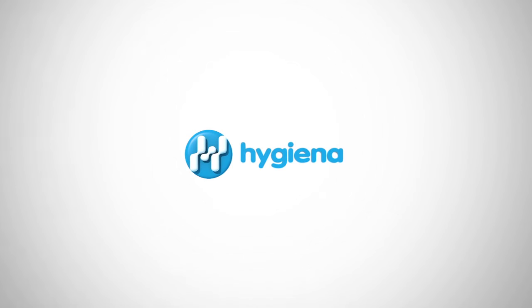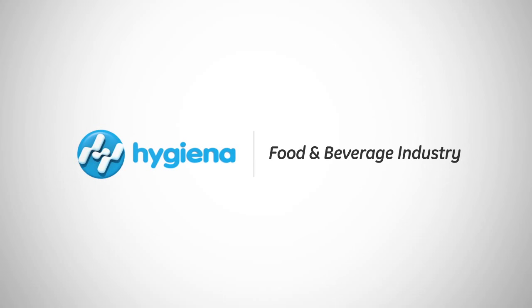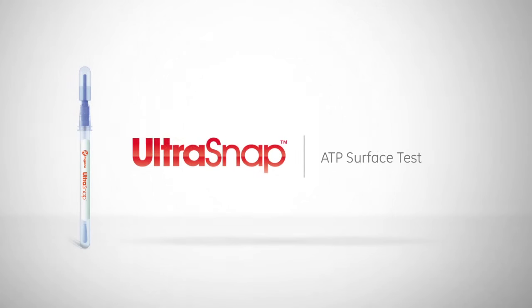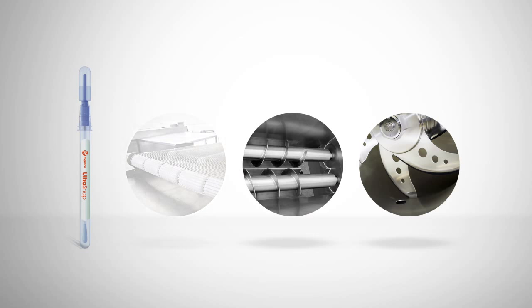This video will feature the benefits and proper use of UltraSnap, Hygiena's best-selling ATP sanitation monitoring test. UltraSnap is a user-friendly ATP test used for assessing the cleanliness of food contact surfaces and other processing equipment after cleaning.